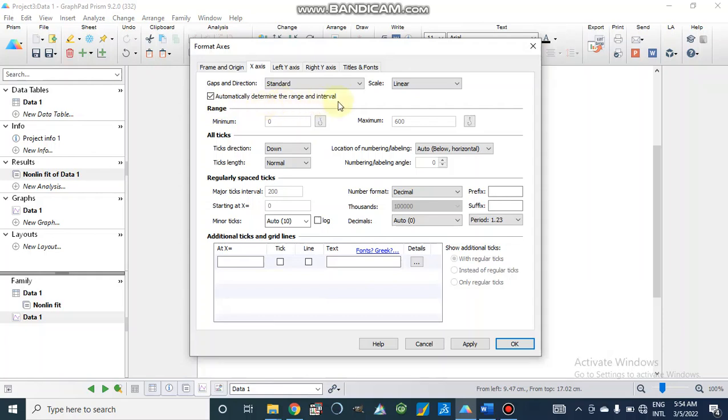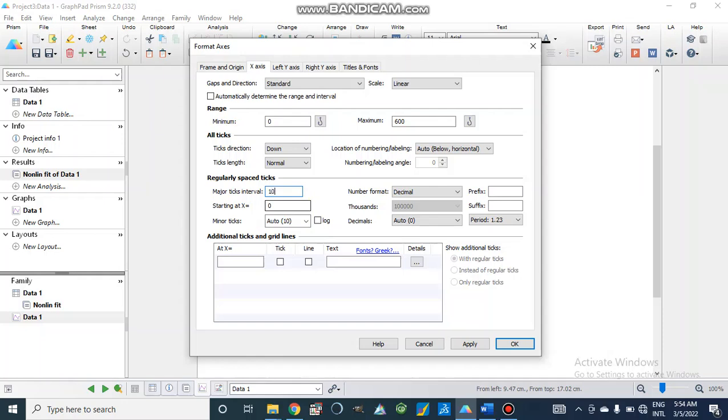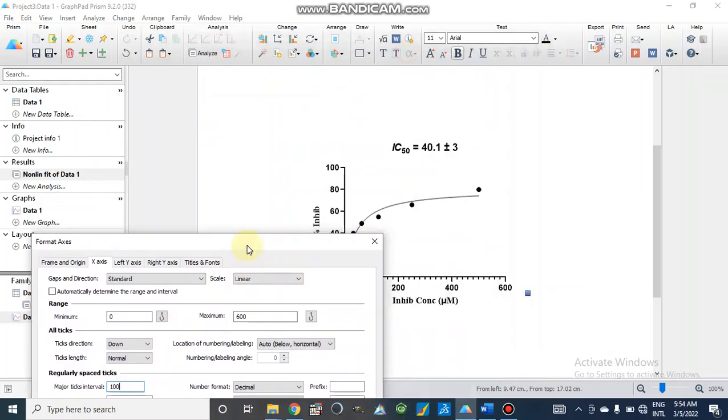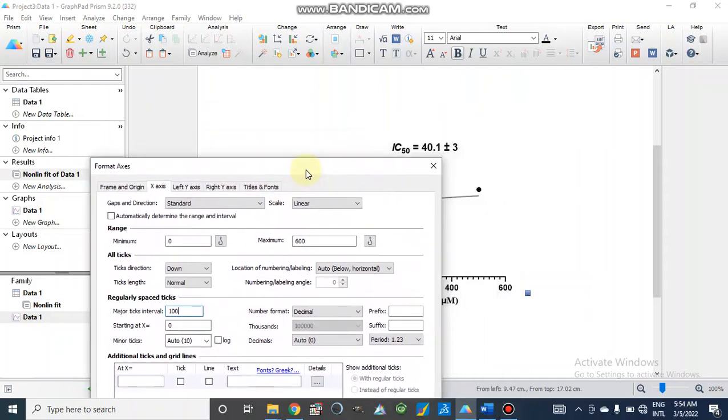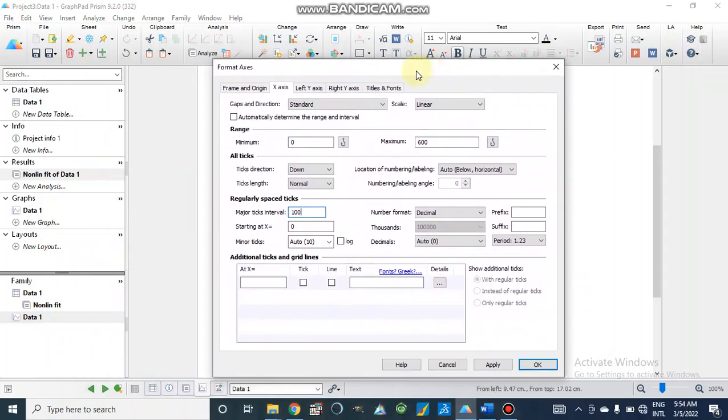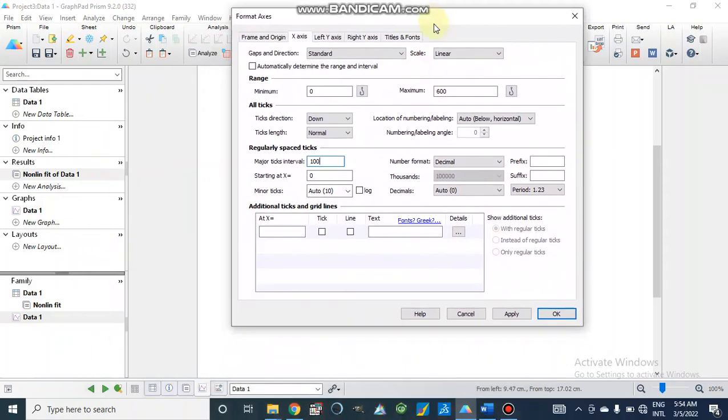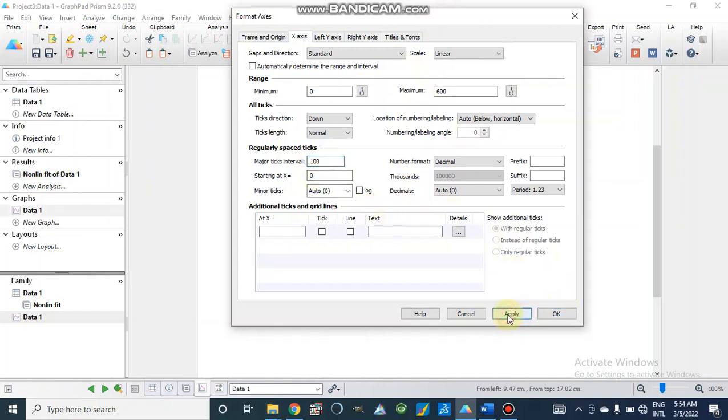Determine the range and interval or we can choose by our own. That is major tick intervals. I am going to make 50 or 100, we can take 100 tick intervals. And minimum range to maximum is 600. Let's suppose 600 is more, we can also select 500 in which our data lies. So here we will go to Apply.